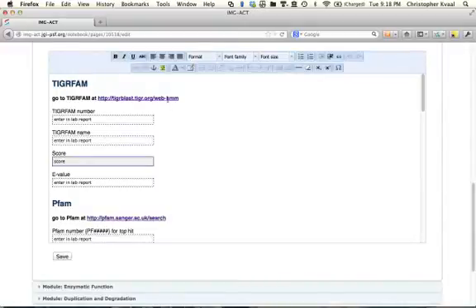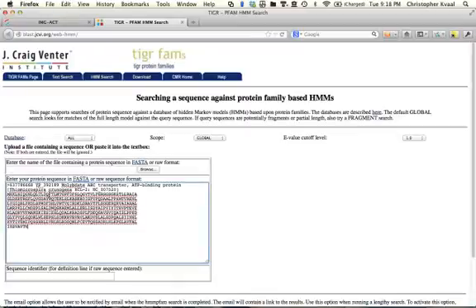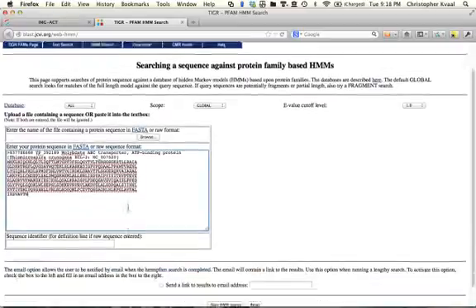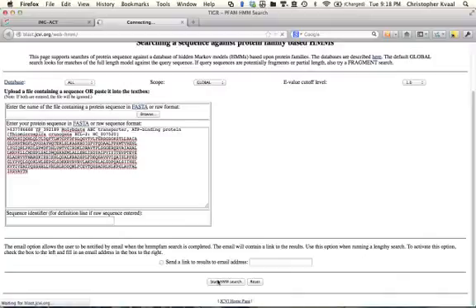This first link is for something called TigerFam. It's going to look very basic and very simple. This one takes a long time, so we're going to get it going and I'll talk about it.